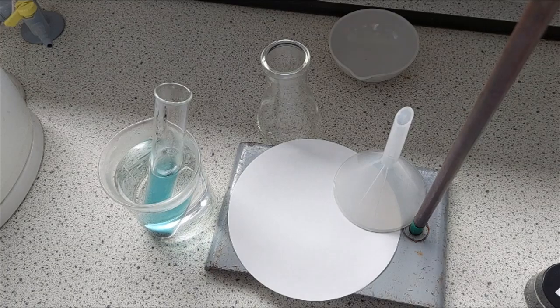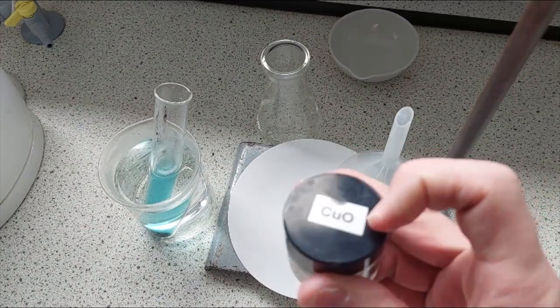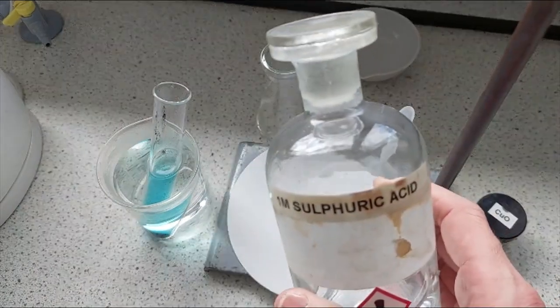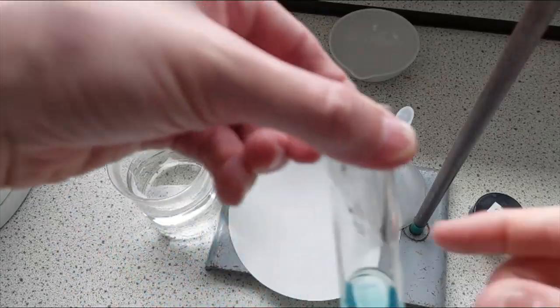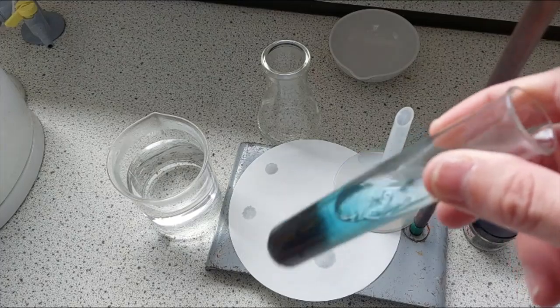The copper comes from the copper oxide. That's what the Cu stands for, copper, and O oxygen, copper oxide. And the sulfate comes from the sulfuric acid. Whenever you react a metal compound with sulfuric acid, you create a sulfate, and copper sulfate is this beautiful blue colour. Now as you can see, there is still some black powder at the bottom. Again, I will be giving this a swirl every now and then.